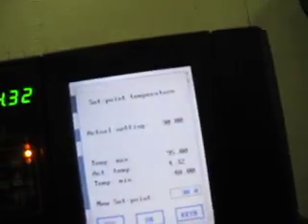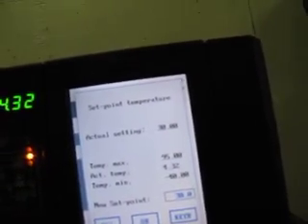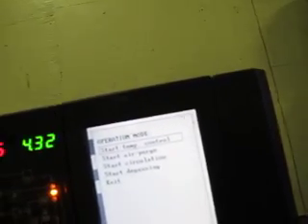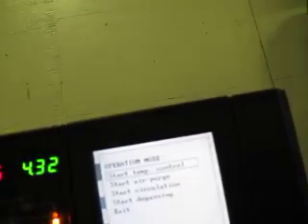I don't know what these buttons do. I press that button — something about set points. It's this one. Start air purge. Start circulation. Start degassing. Exit.